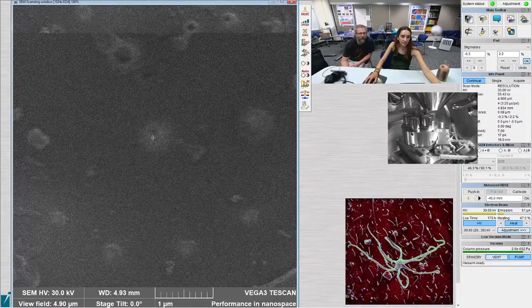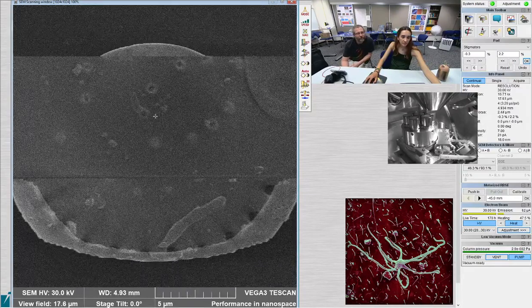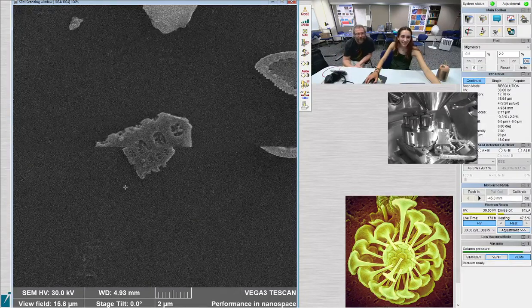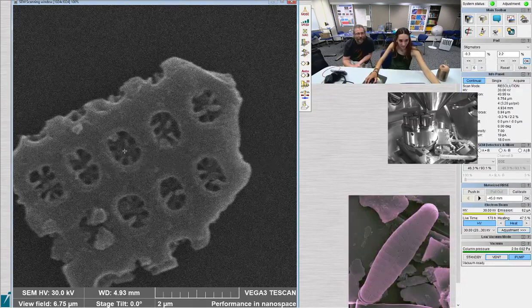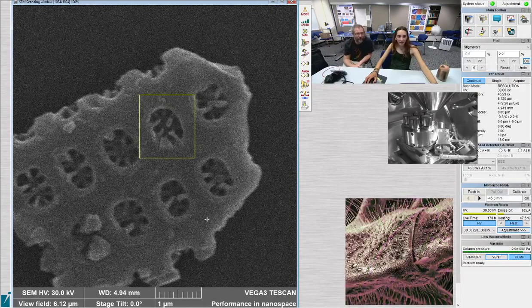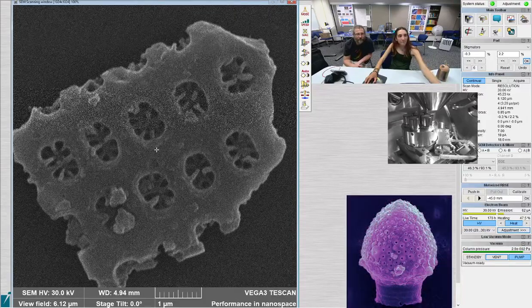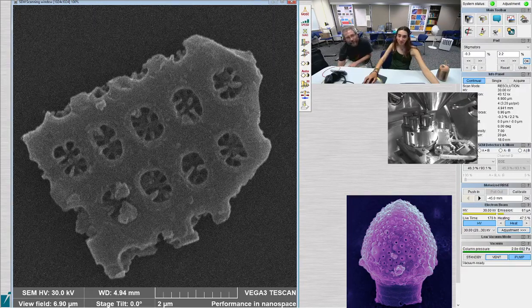I can't really see what the pore covering looks like from that. That's fine. That fragment of Oligocyra that's right there. This one. Look at the pore coverings on it, though. Very pretty. Zoom in and look at those. I bet they're spectacular. Just a fragment of a diatom. I think that's the inside view of the ones that we saw that look like a spider web on the outside. I think this is what it looks like on the inside. Cool. What's neat is that that's 6 million years old and all of the structure is right there. Oh, right, yeah. It's broken, exposed.